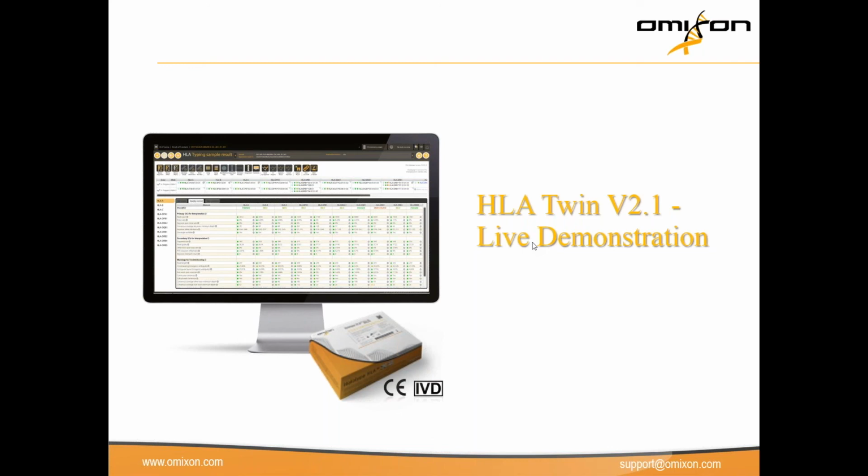Okay. So I have another question here. It says, how long has the development of the Biomek 4000 method taken? And will it take the same time, or will it be shorter now that it's already developed? I think it would be much quicker, because we've gone through all the trials that are needed. And even given that we haven't spent all our time on it, it could be done a lot quicker than what we have done.